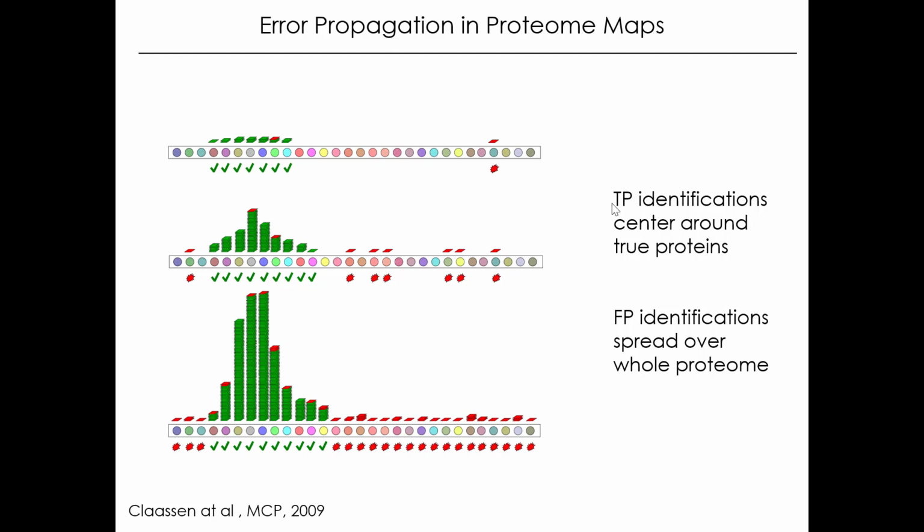What we observe then is that the proteins which we know already are in the sample will be identified with an increasing number of spectra because we know they're in there, they're true, they're always within these 99% true ones. But the false ones, the 1%, there's no reason why they would associate with any specific protein. They're simply randomly distributed over all the proteins of the genome.